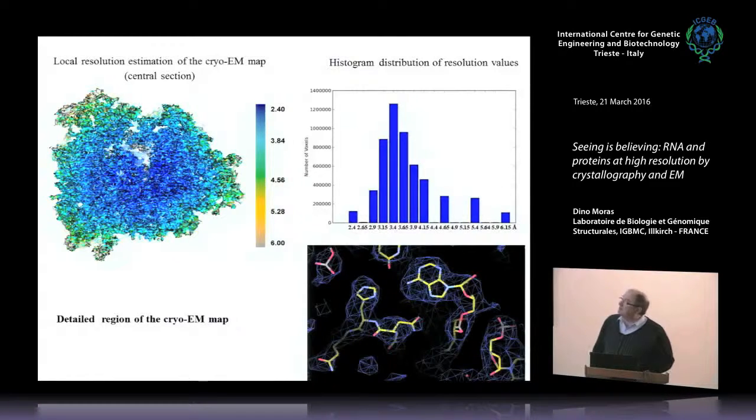That's the density of the best part. That is somewhere, I don't know exactly, around here. And you see that you can build at this level, the density is like a crystallographic high resolution density that you can interpret with a model.